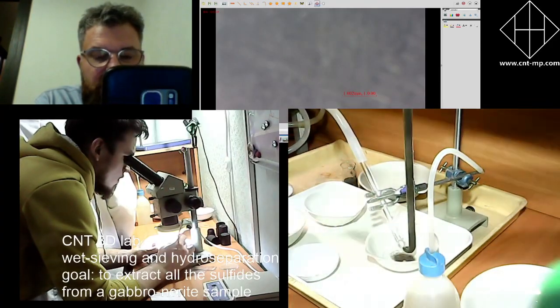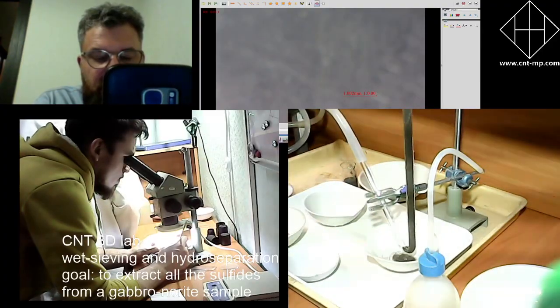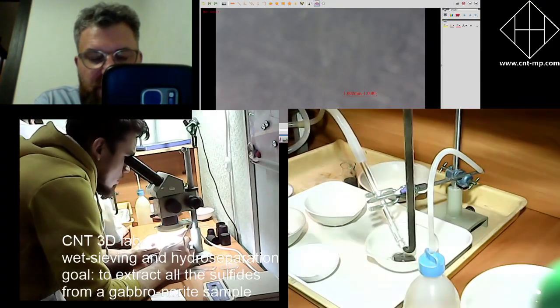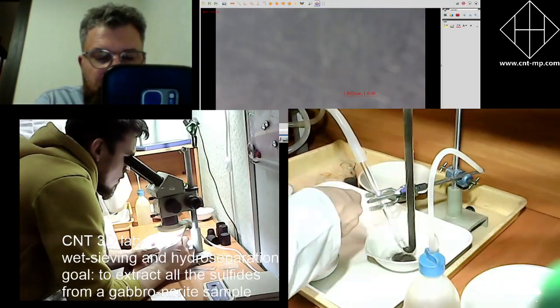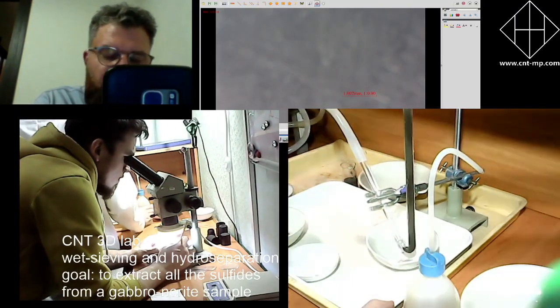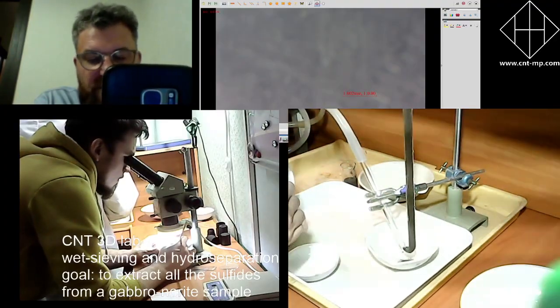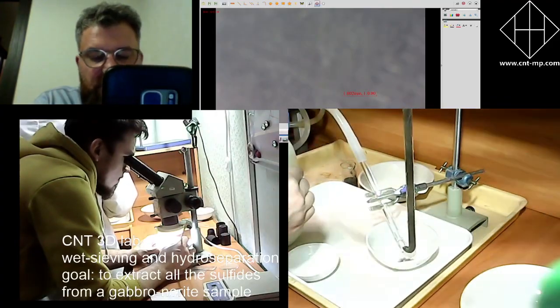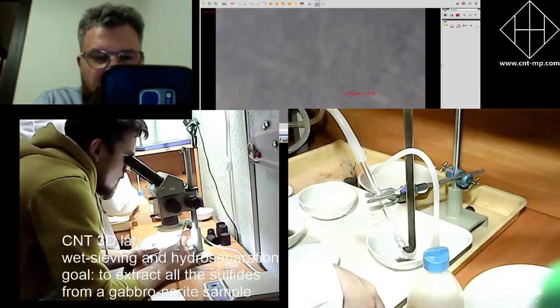You can use the sample for the primary chemical assay, and that will have all these elements that you need. But if you go fraction by fraction, you have to go down to a single grain analysis, so that you will be able to reconcile that chemistry that you have from primary sample on the phase level, on the mineralogy, to understand the distribution of these elements throughout different minerals. That's the main important application of this approach.